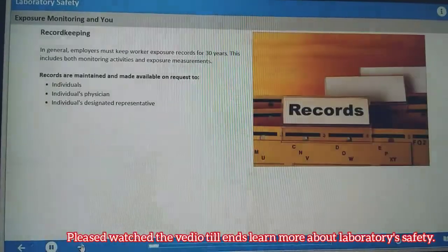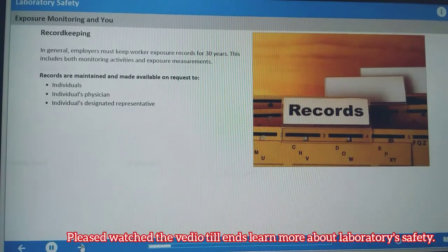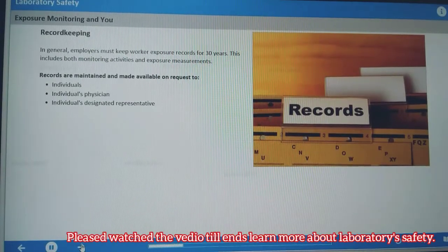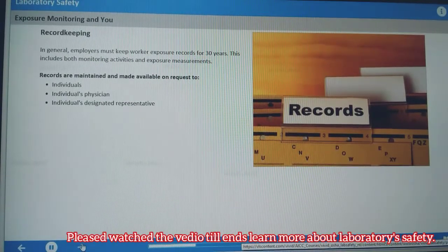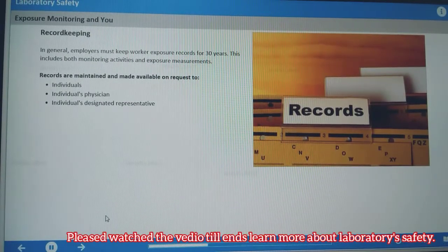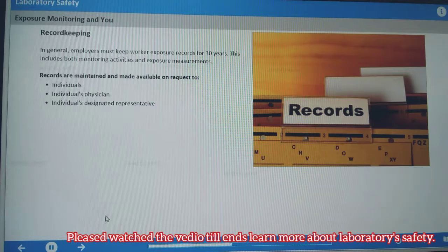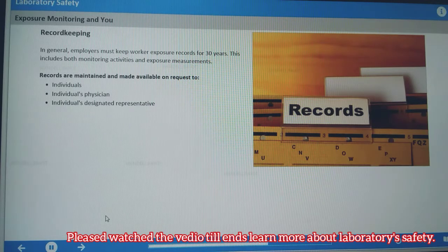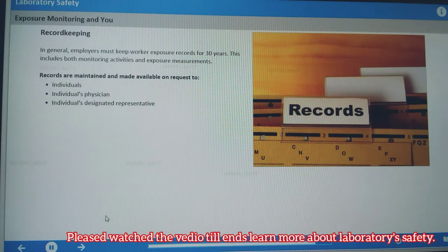In general, employers must keep worker exposure records for 30 years. This includes both monitoring activities and exposure measurements. Employers maintain records and make them available to individuals, their physicians, or their designated representatives.